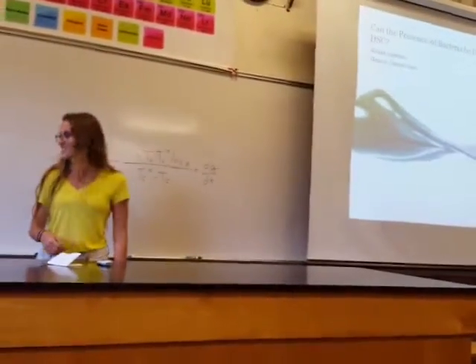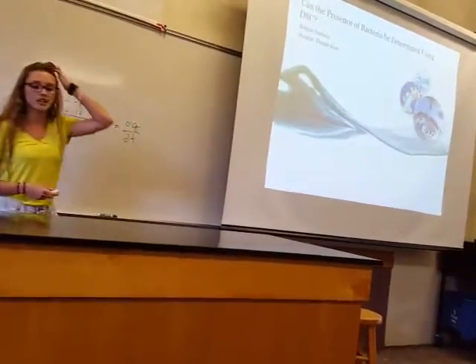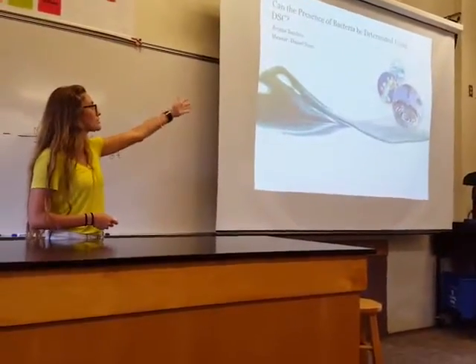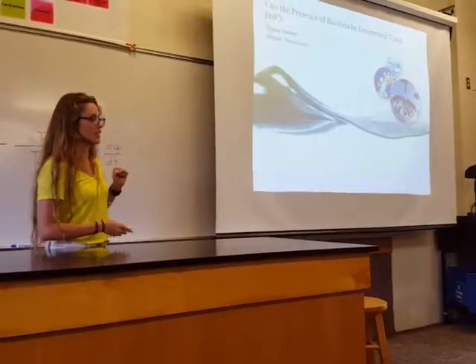I appreciate it. This is the research that I've been working on while I've been here, and it's about being able to determine or detect bacteria using the instrument, the differential scanning calorimeter.